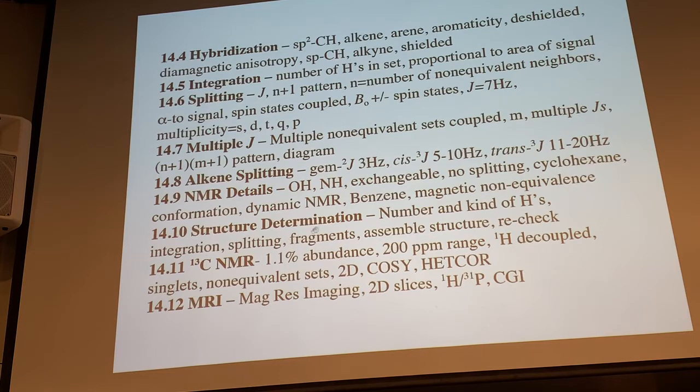And then we'll do structure determinations of these simpler type of molecules. We'll look at the spectra and then compare it with the IR and the mass spec and make determinations. These are puzzles. These are molecular puzzles. If you like solving crossword puzzles or if you like detective stories or whatever, putting together the information and then coming up with a conclusion that has to do it.